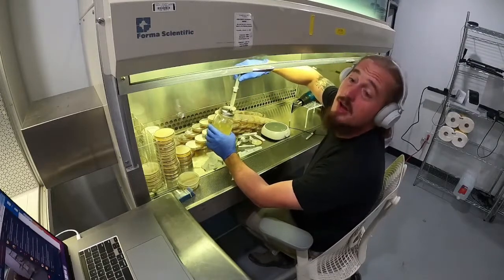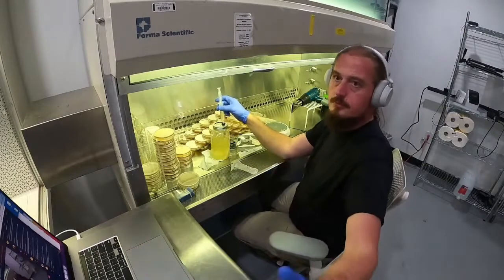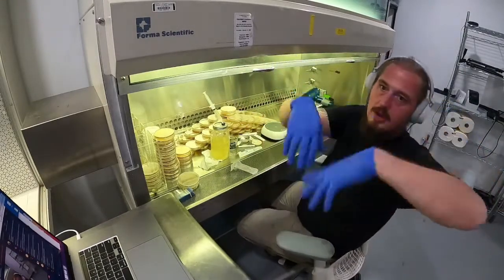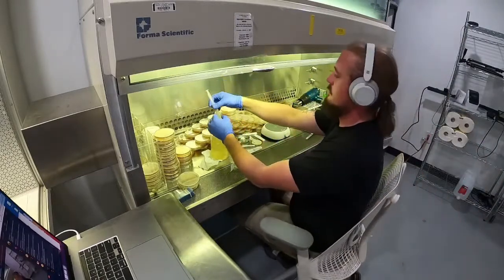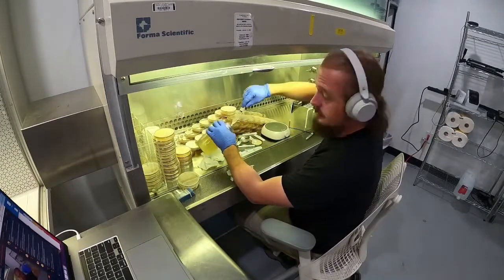So that one, go ahead and cut the top off. Let it fruit out of the top. Yeah, or just cut a slit across the front, like a hood. Yeah. And this is the one that will overhang and then it will grow. Yep.